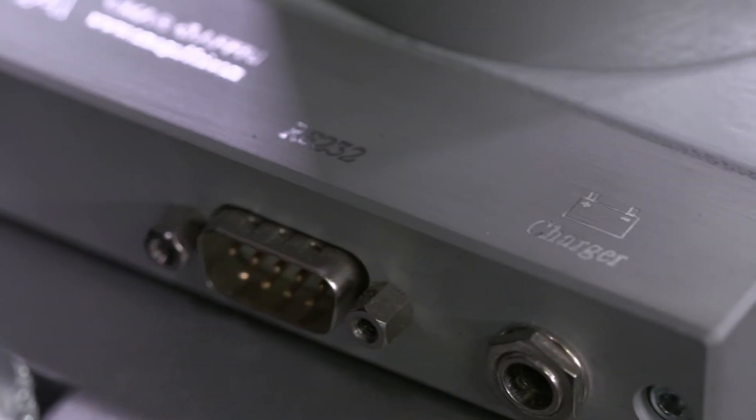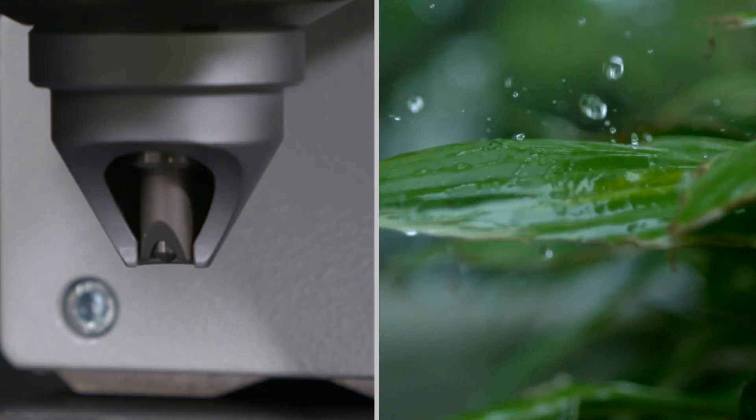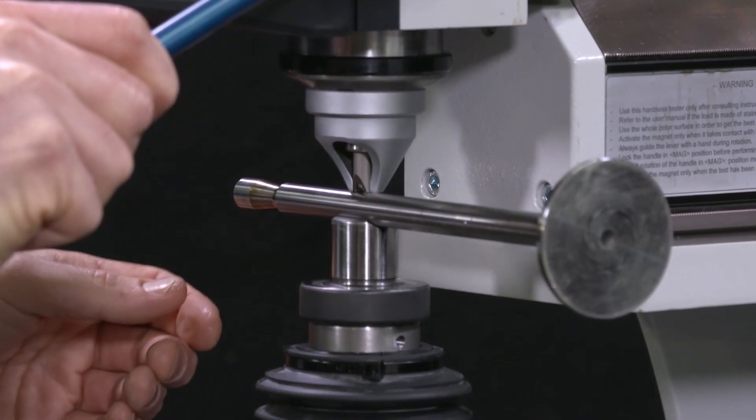and readings. The AFRI-RSD-MAG is an energy-efficient, low-absorption hardness tester.